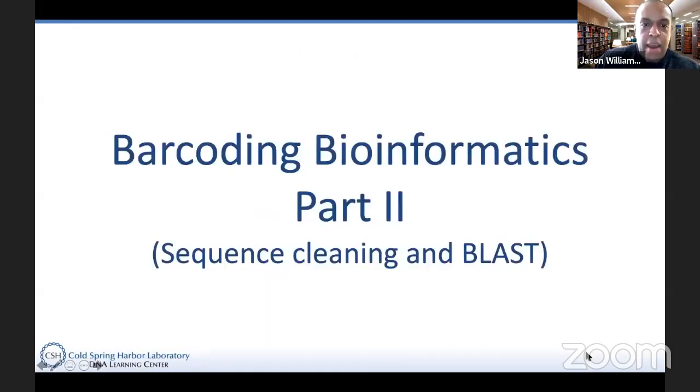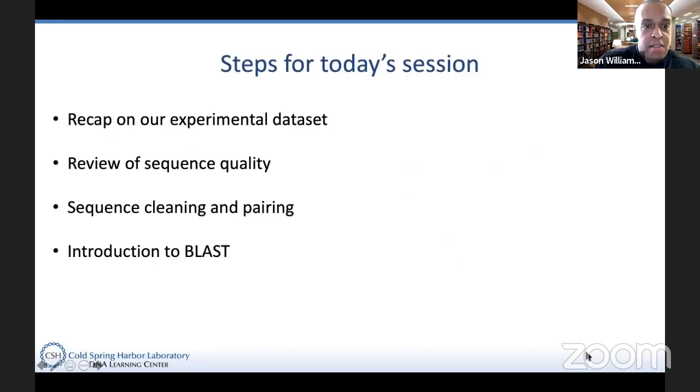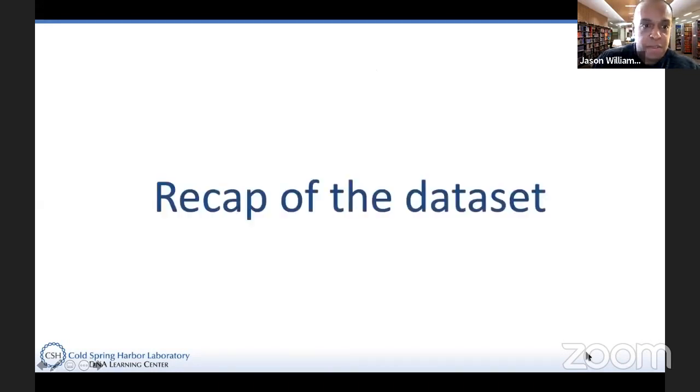Okay, so this episode is all about sequence cleaning and BLAST. We're going to pick up a little bit from last week. For the steps that we have to do this week, we're going to do the recap and just make sure you know where we were last week and how we got there. We're going to make sure you understand sequence quality. I'm going to add into that. I've got a lot of slides today about experimental design. That's really, really important. We're going to do the sequence cleaning and pairing, and we're going to give you an introduction to BLAST.